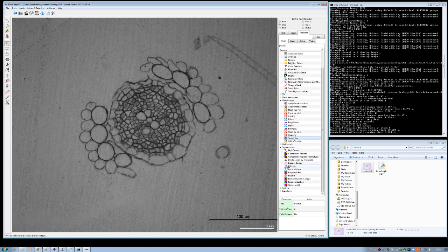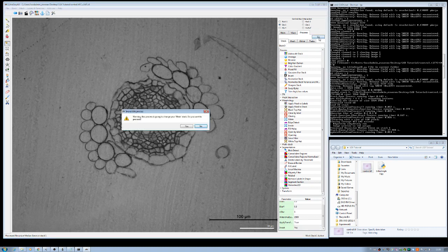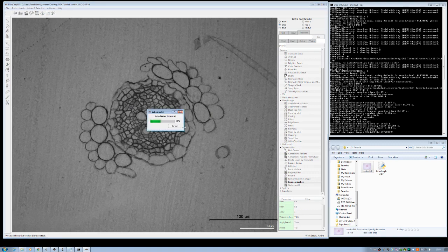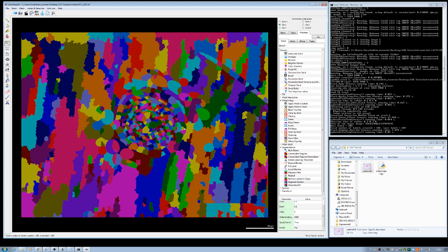Go to Segmentation. In the Invert option, change it to Yes and click OK. It will give you a warning — you can proceed by clicking Yes. As you can see, it's done.